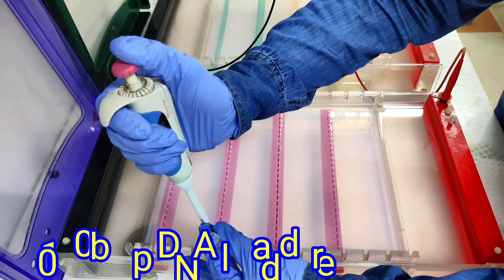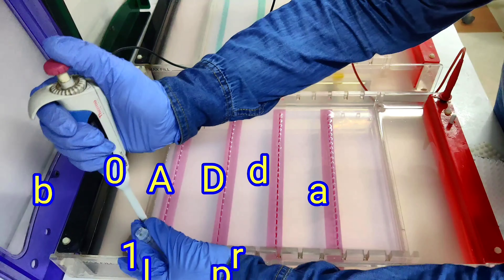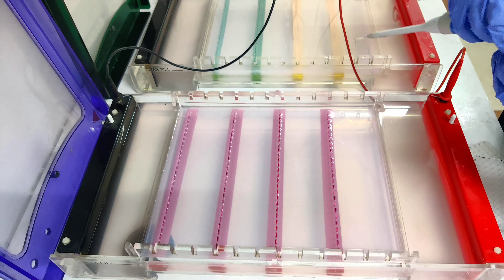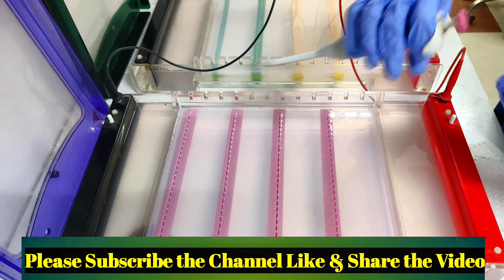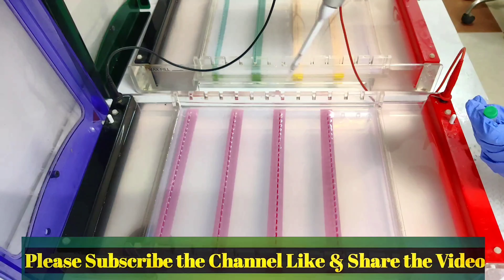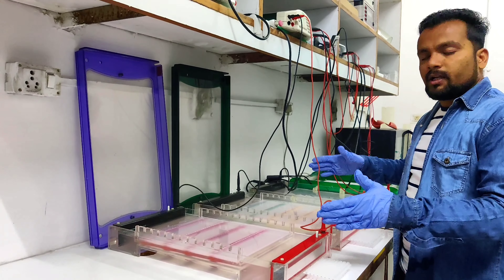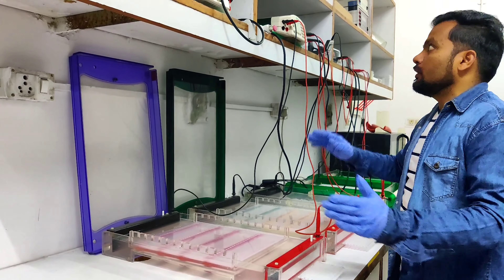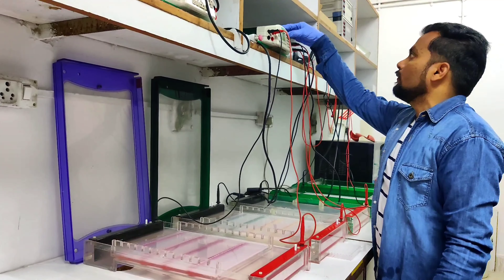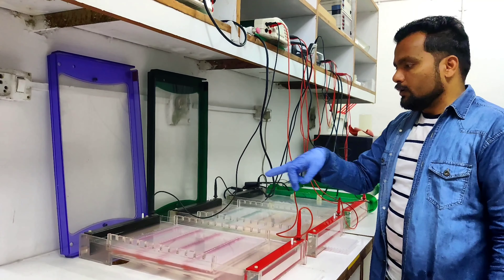The lower band is 100 base pair in this ladder and the upper one is 1 kb. For the first loading we have to load the ladder on the left side, and for the second loading we have to load the ladder on the right side. We loaded the two PCR products in these two gel units. Now I simply set it to 150 volts and run it.